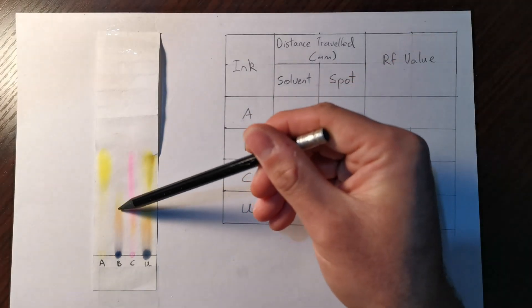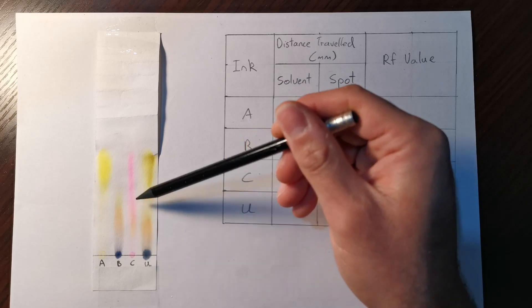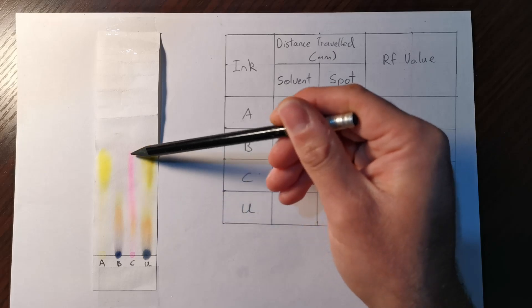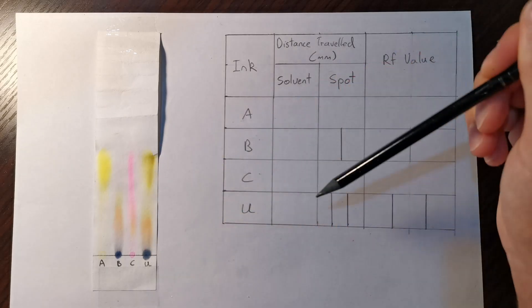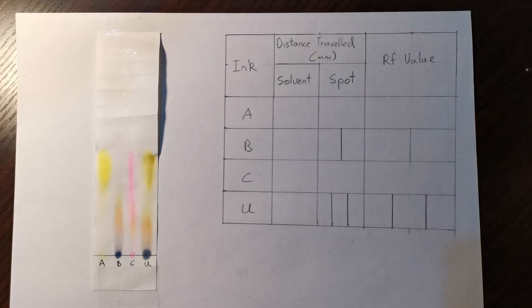For B, it's separated into two spots — a yellow spot at the top and an orange spot underneath. For C, it's separated into one red spot, which means it's pure. For U, it's separated into three spots. We're going to measure the distance traveled for each spot and fill them in the table.